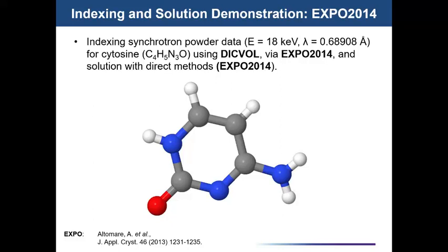Sorry, did you have a question? Would it also consider the intensity when indexing, or is it only the peak positions? For indexing, it's just the peak positions. When it does the structure solution here, it's all about the intensities.